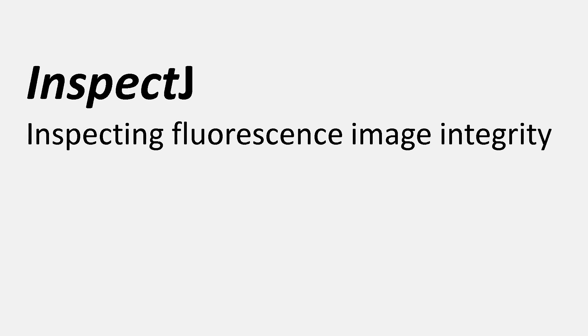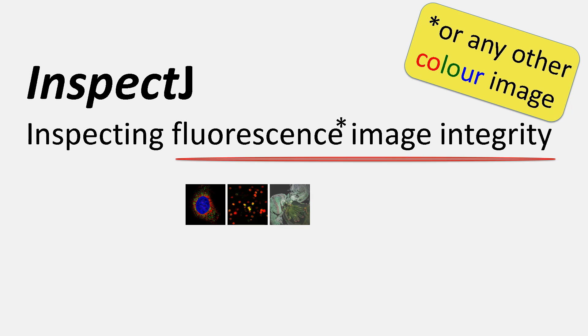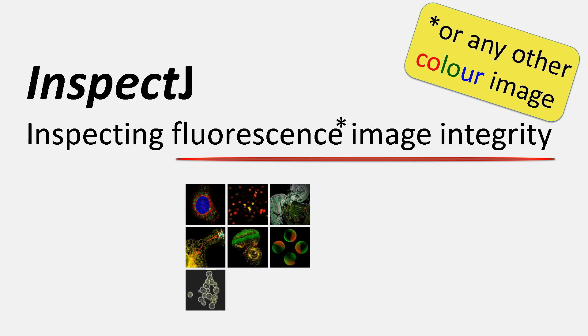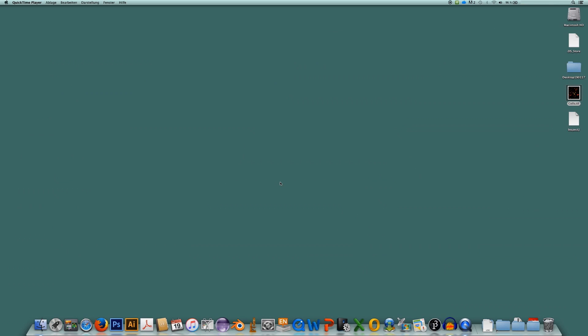Hi there! In this video I'm going to show you how to inspect fluorescence images with InspectJ. Here I will show you a video screen capture for you to really see what's going on on my computer monitor.